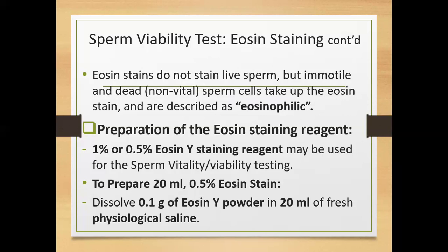Okay, we don't want that to happen in the sperm viability test. We don't want it to happen because we want the cell to actually be its normal self. So if you want the cell to be in its normal self, what should be the medium?